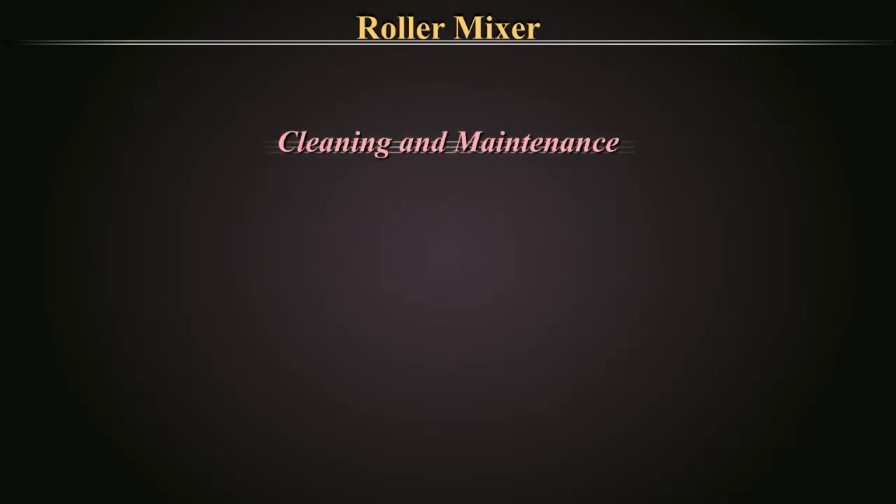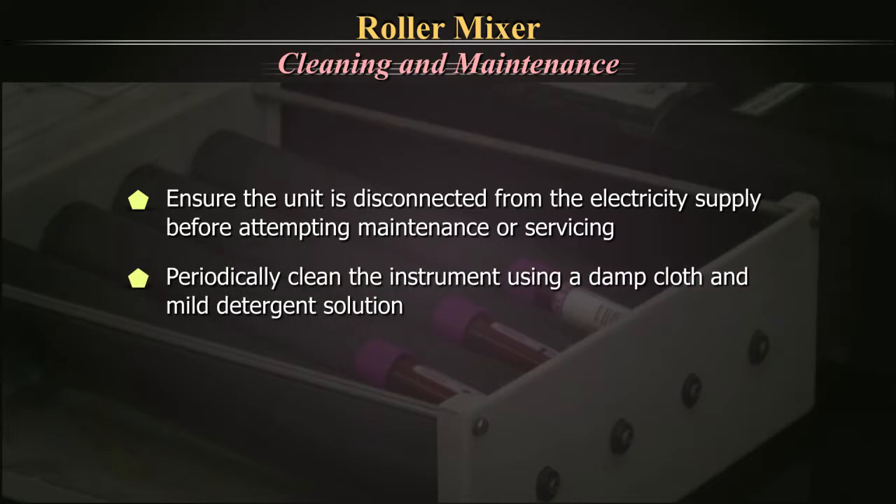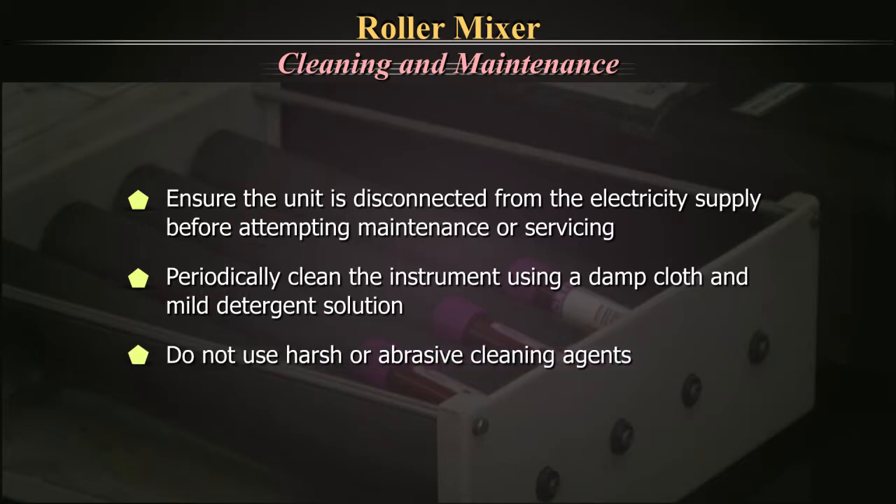Cleaning and Maintenance: Ensure the unit is disconnected from the electricity supply before attempting maintenance or servicing. Periodically clean the instrument using a damp cloth and mild detergent solution. Do not use harsh or abrasive cleaning agents.